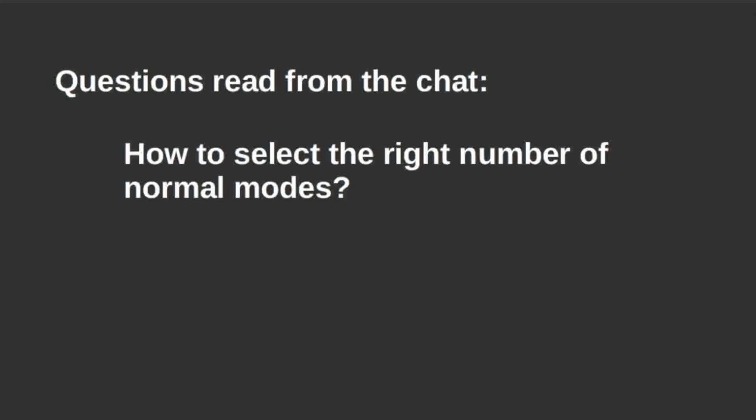Then you can also have some prior knowledge about the function of your complex and potential changes, which means that you are allowed not to restrict to these motions, but to include them.